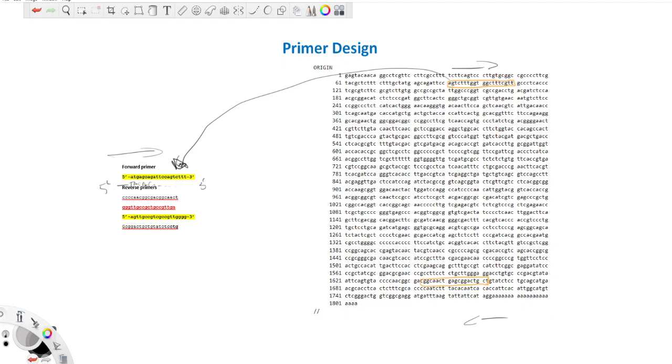So what have I done for this specific region? For these reverse primers, of course, I selected my region. I think what I did here is I went a little bit back up to here. Let me just show you the sequence that I actually went for.